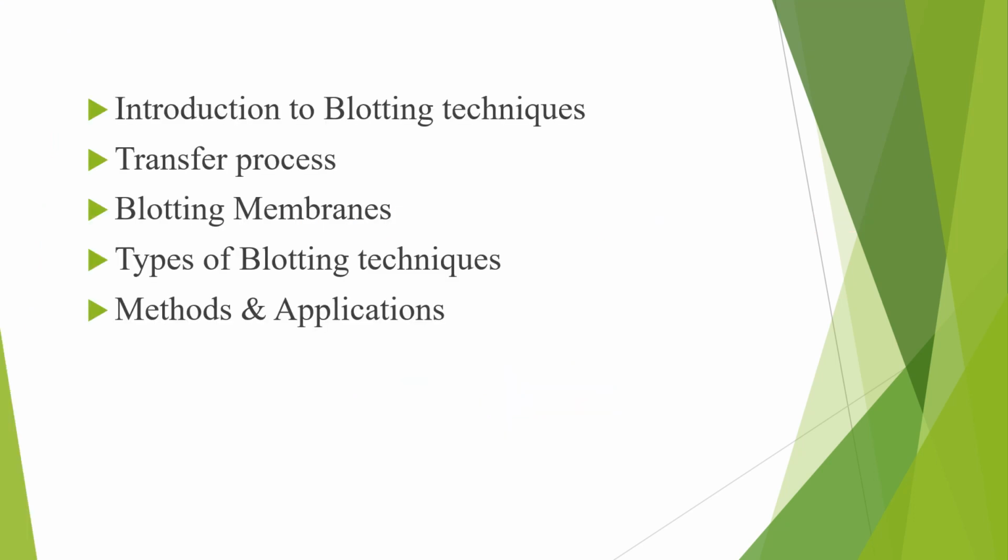Today's topic for discussion is Southern blotting technique. In this video, we are going to discuss the introduction to blotting techniques, transfer process, blotting membranes, types of blotting techniques, methods and applications.